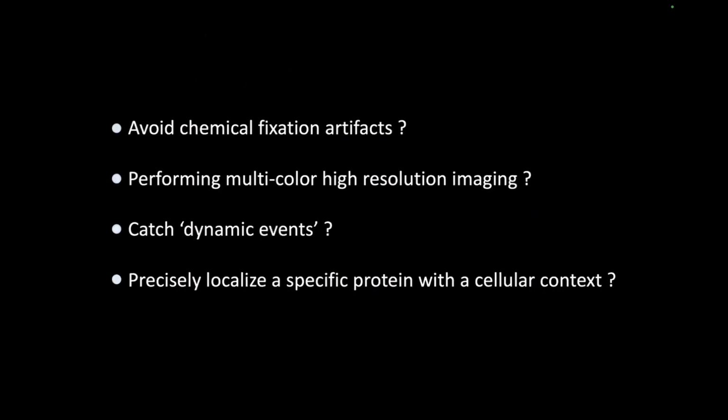Okay, so the question that we were asking when we developed this was, is it possible to avoid chemical fixation artifacts? Can we perform multicolor and high-resolution imaging? Catch dynamic events, I don't put too much emphasis on this because, of course, we are doing fixed microscopy, but you will see that it's pretty nice how many dynamic elements we can catch when we combine with cryofixation. And also, by the use of this light microscopy combined with the cryo, we can have a cellular context in which we precisely localize our proteins.